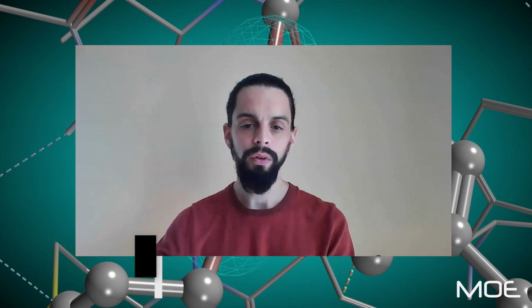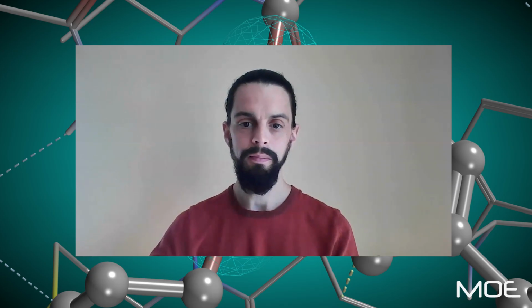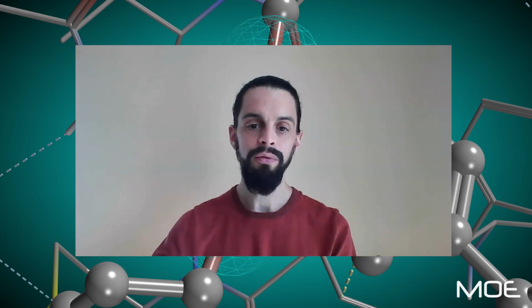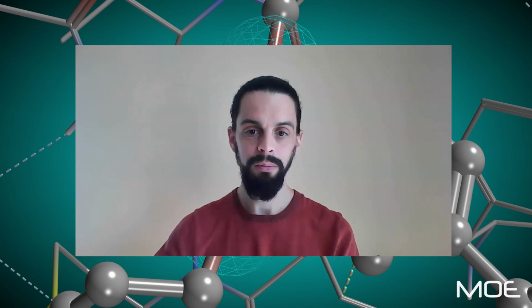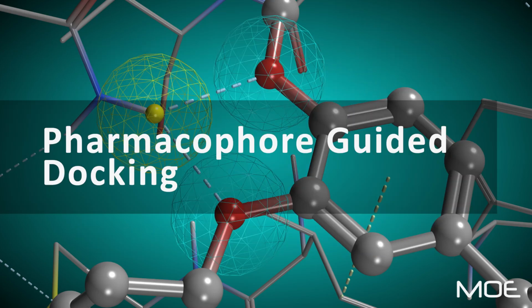Today I'd like to introduce the docking tools that we have in MOE. In this session we're going to be using Pharmacophore-Guided Docking to dock a library of ligands and ensure that we're generating high-quality docked poses with all key interactions preserved. So let's get started.